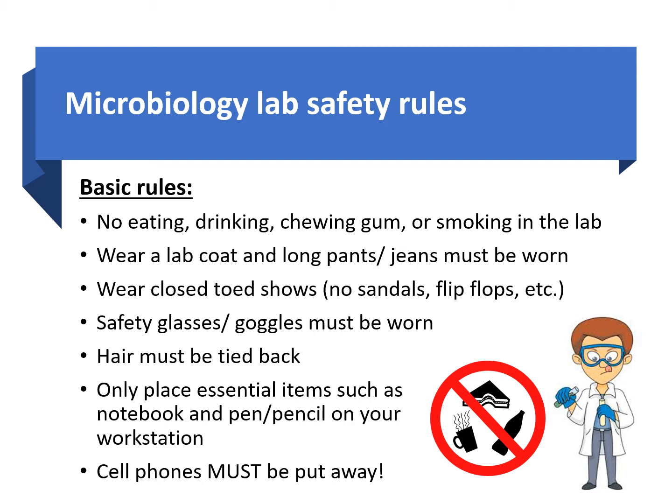Microbiology lab procedures usually require you to time yourself when you are, let's say, doing some staining procedures. Now, can students use their cell phone as a timer? No. Cell phones are not even allowed to be used as timers. You have to put your cell phone away because you do not want your cell phone to be there while you're handling all of those different types of bacteria in the class, and then your cell phone would get contaminated.